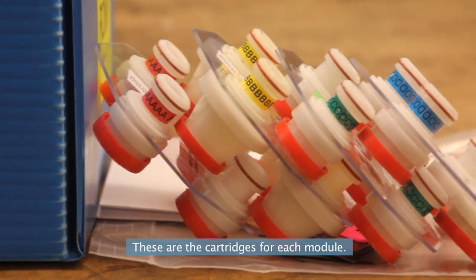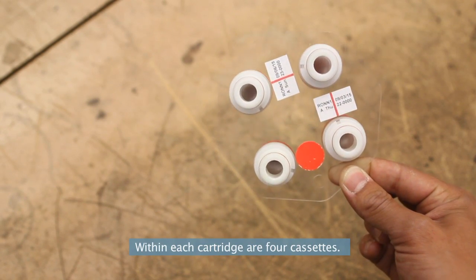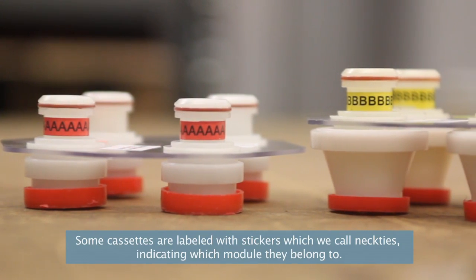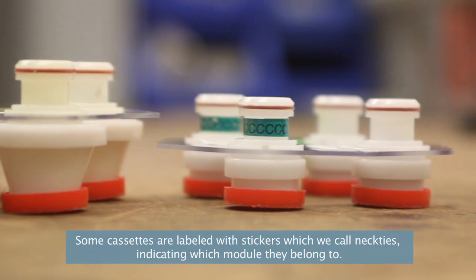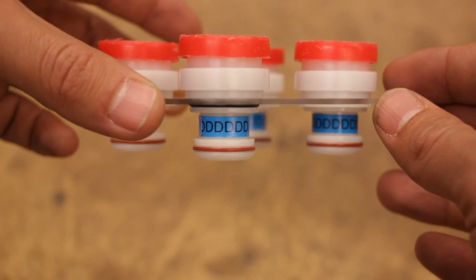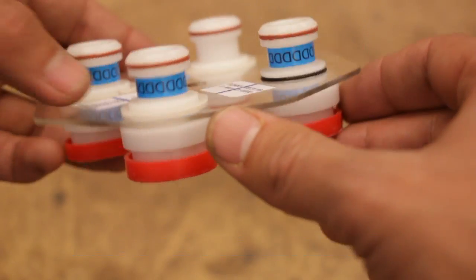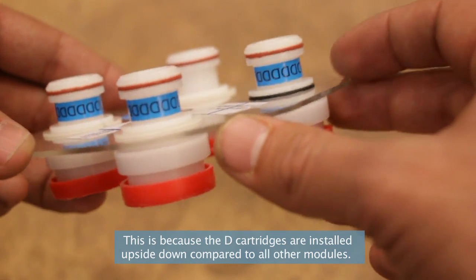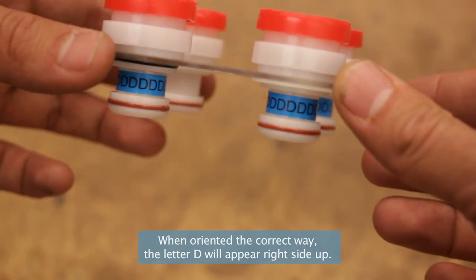These are the cartridges for each module. Within each cartridge are 4 cassettes. Some cassettes are labeled with stickers, which we call neckties, indicating which module they belong to. Note that the D stickers have the letters printed upside down. This is because the D cartridges are installed upside down compared to all other modules. When oriented the correct way, the letter D will appear right side up.